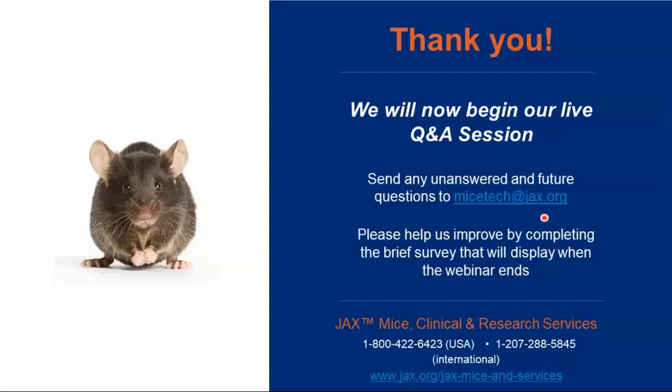So I'll just lay out the basics just in case anybody isn't sure. A pair would just be one male, one female in a box for breeding. A trio would be one male and two females in a box for breeding. One advantage of trios is you essentially have two breeding females in one box, so the number of boxes you have on the shelf is halved. It just takes up less space on your shelves, which means it uses less resources for you.